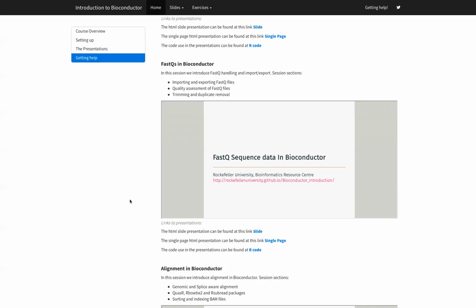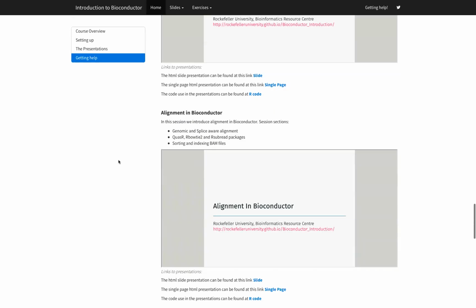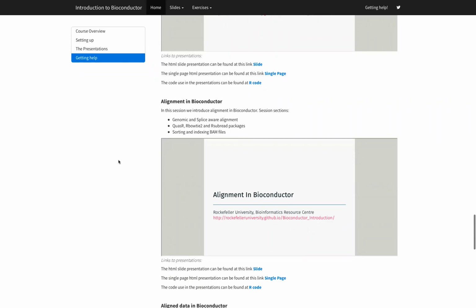In total, do we have more G's or C's in our reads than we'd expect? And then we looked at how we can potentially do a bit of filtering, a bit of manipulation of our FASTQ, and then write that back out to another FASTQ. We also very briefly introduced you to rfastp, which is our own software, written in C++, but you can access it through R.